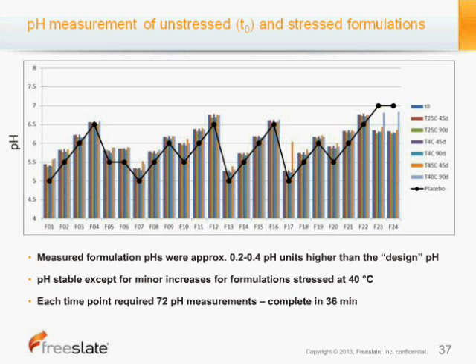But what's of note is that each time we measured the pH of a vial rack, or the sample formulations at the specific time point, it required 72 pH measurements. And we were able to complete those pH measurements in about 36 minutes.